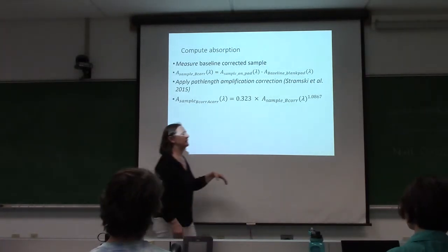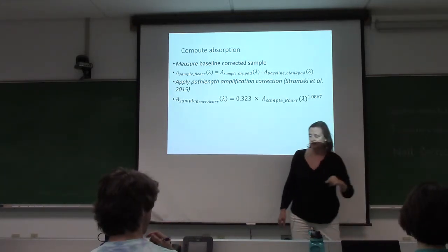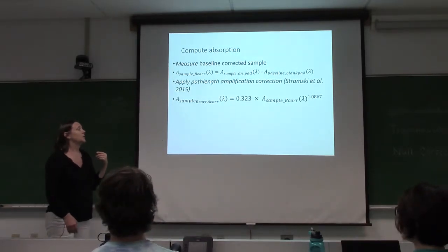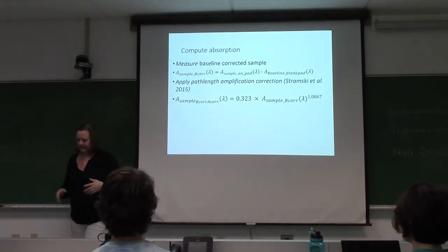Before I had a center-mounted integrating sphere, I did transmission mode, which I'll spend a few minutes on because I had a question after class. And so because I am just not an empirical, I'm not good with empirical models because of exactly those things. They work for the situation at hand.